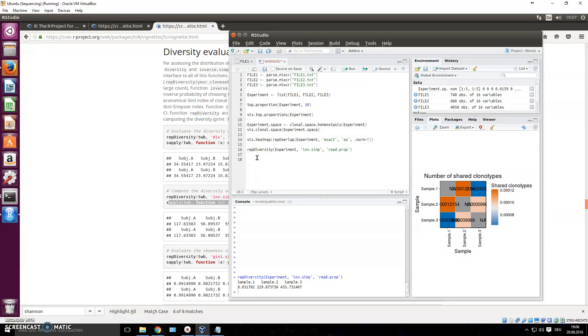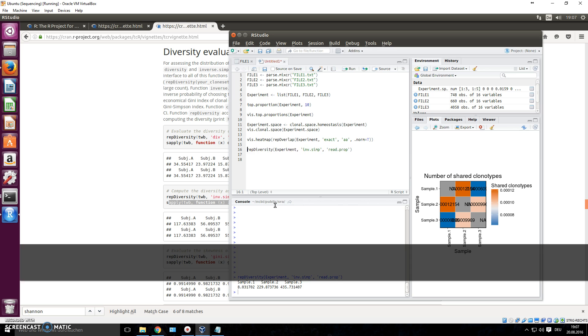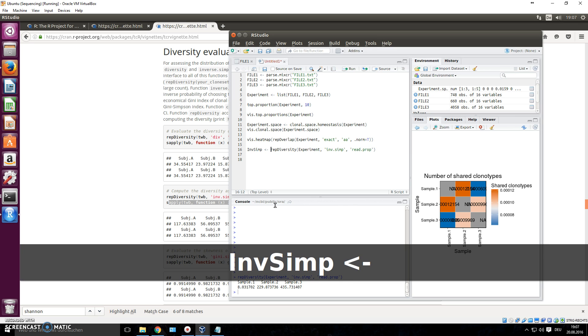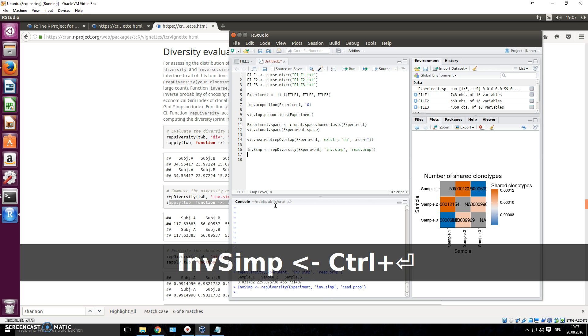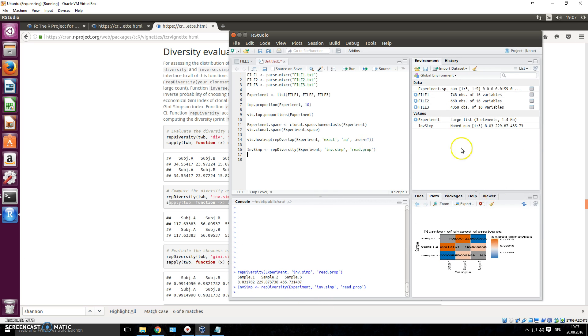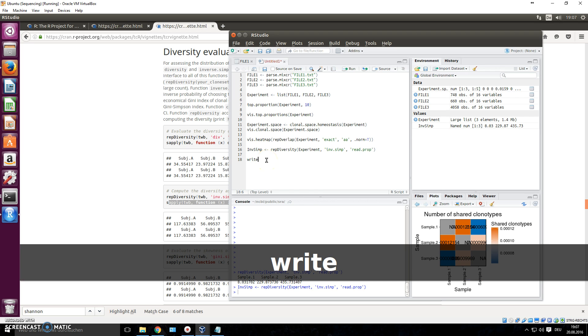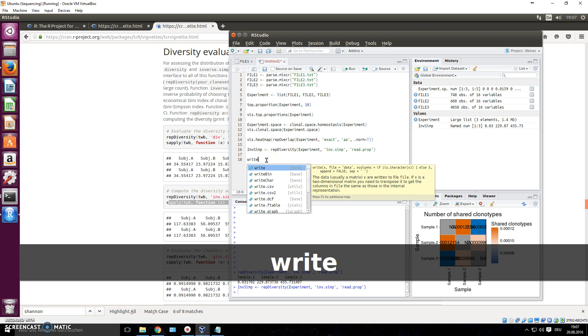Just assign whatever you want to save as an object. So let's say we want to save exactly this thing right here, our inverse Simpson index analysis. You can name this, let's say inf_simp, and we assign it to object and press CTRL enter. So now we'll have it right here in our global environment.